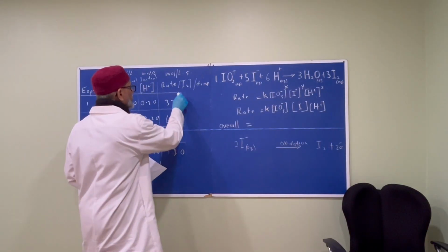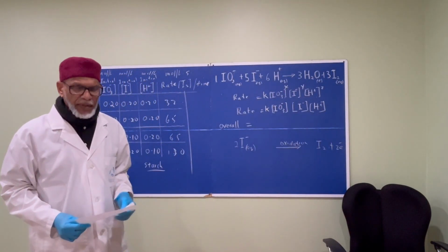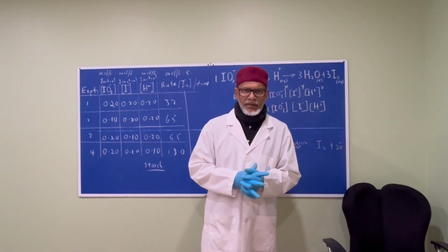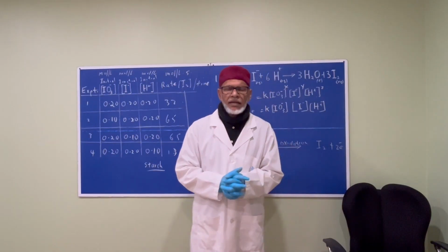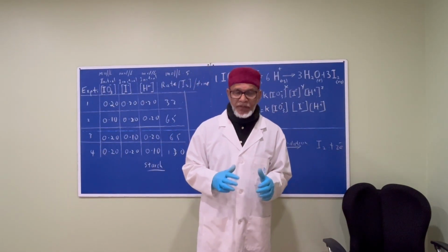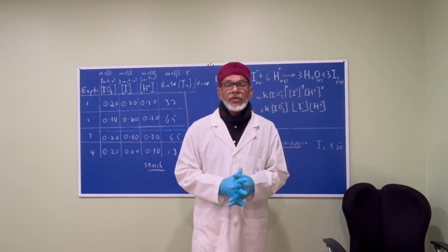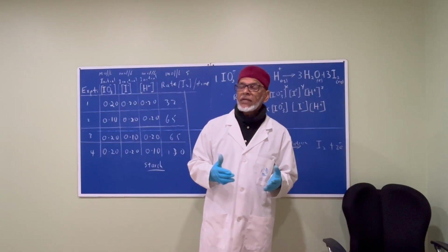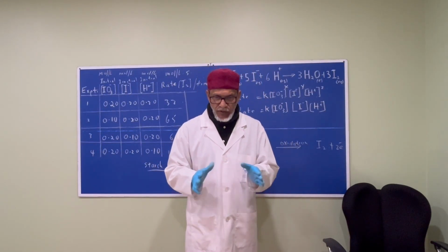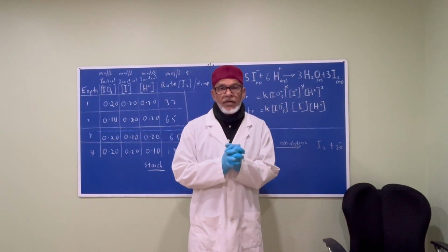Now, we can try to find out what is the rate of the reaction. Remember the last time we made an assumption? In the case of the sodium thiosulphate reaction with hydrochloric acid, we said it must have taken the same amount of sulfur to obscure the external vision. In this case, we're making the same point, that it must have taken the same amount of iodine to obscure that white piece of paper from vision.